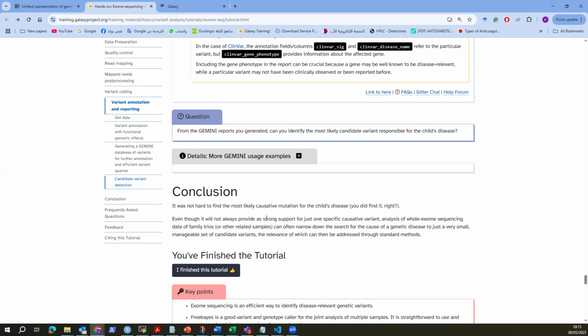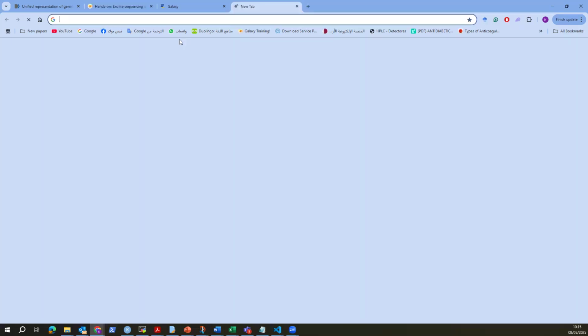expand the horizon with what Gemini can provide. I strongly recommend following other training materials. There will be another training material that covers the advanced use of Gemini for more precise searches. I got mixed up with this training and the next one, so you can find that in the learning path. I will just show you here.